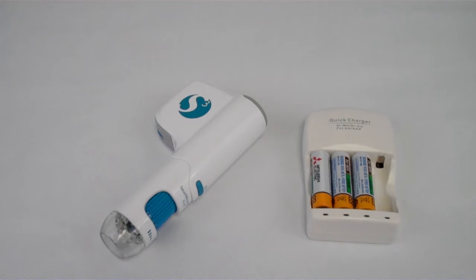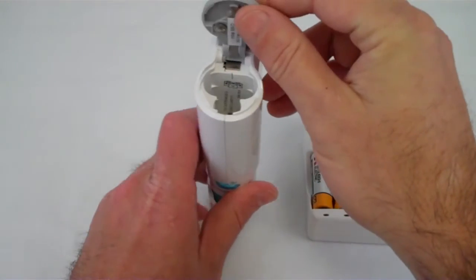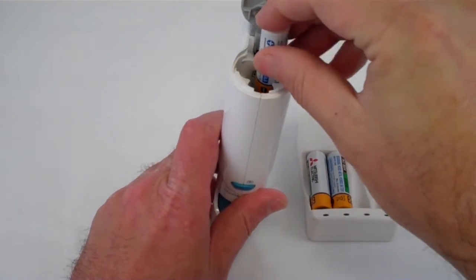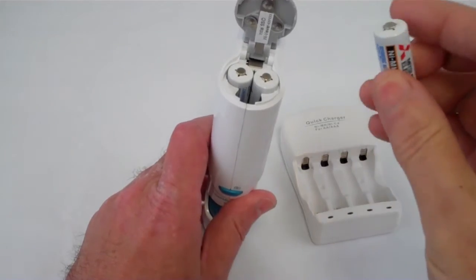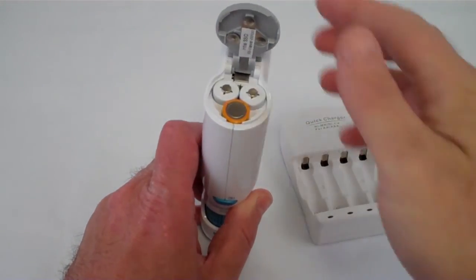Once they've been charged, you will open the battery compartment for the iGoTo. See the battery diagram inside the compartment and follow the instructions for putting the batteries in. You will close the battery compartment door and turn the scope on. You'll be ready to go.